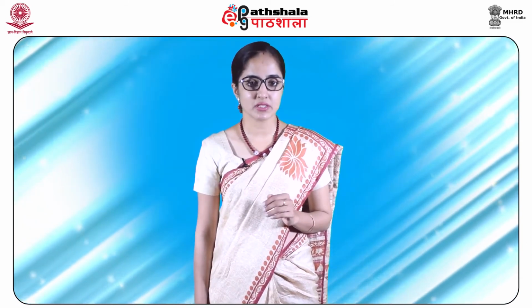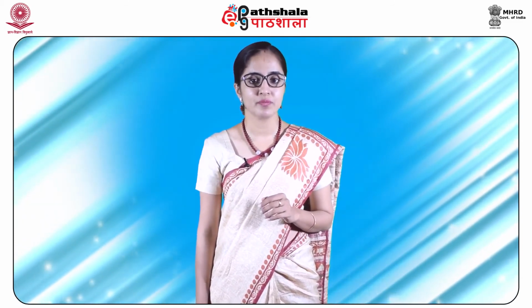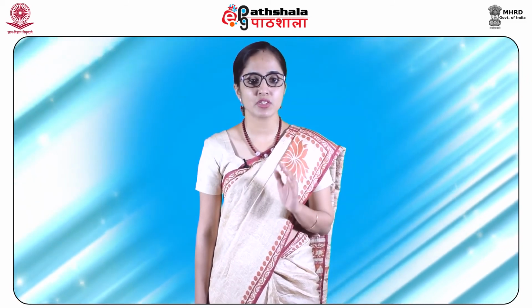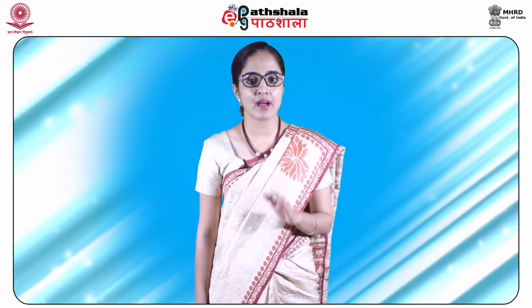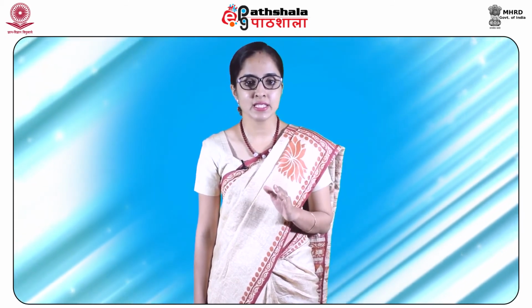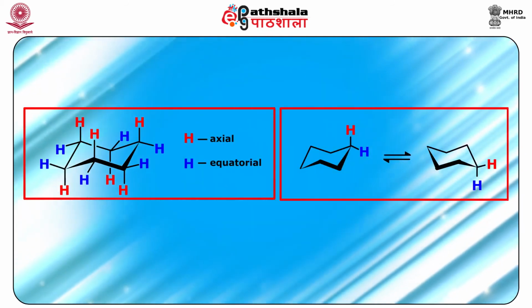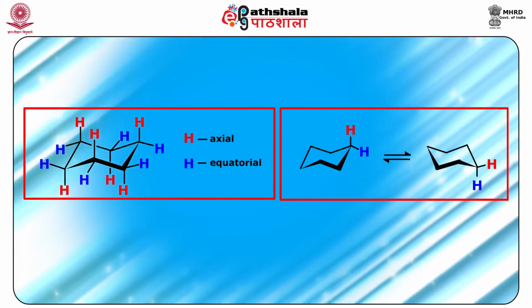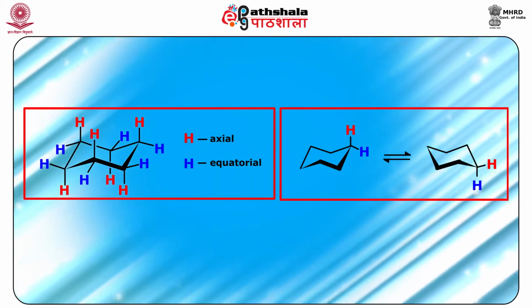While the spectrometer is acquiring the spectrum, the ring flipping is rapid between the two chair conformations, producing a blurry picture. The spectrometer only sees the average electronic environment of the protons, and hence only one signal is observed. However, students, if the sample of cyclohexane is cooled inside the spectrometer, the ring flipping process occurs at a very slow rate.